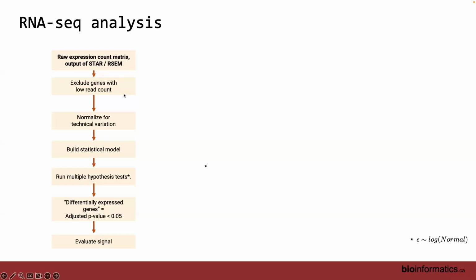Because we are doing multiple testing correction, one thing we'll talk about is that when you test lots of things, a fraction of them are going to be significant just by chance, just because of the nature of the statistical framework we use to call significance. So what you don't want to do is have a lot of uninformative stuff in there, which is going to serve no purpose other than to increase your false positives. For example, if I have cases and controls and half the genes are identical across cases and controls, I might as well not test them. Or if half the genes are not even expressed, why bother testing a bunch of zeros or near zeros? All that's going to do is make me test twice as many genes and increase my false positives by twice, so 100%.